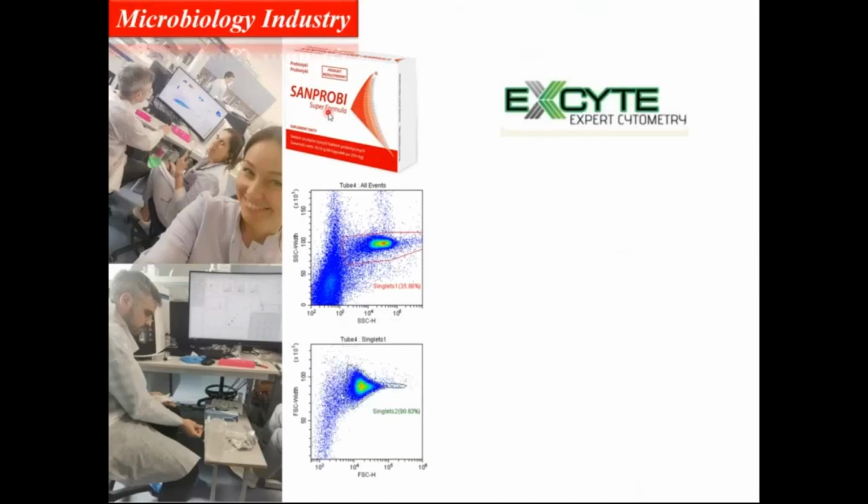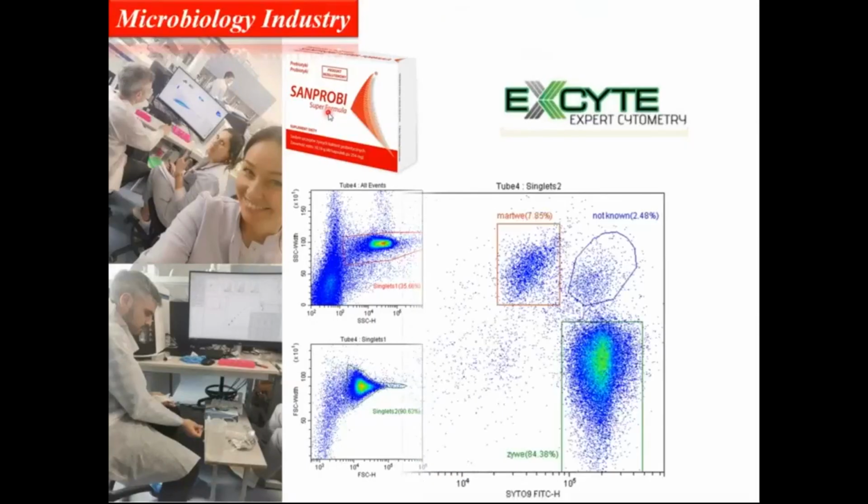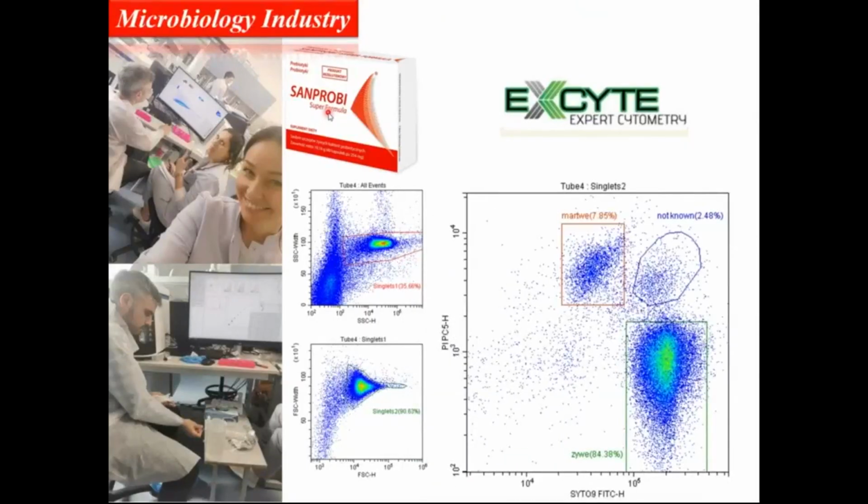And what we wanted to do is create clones. So we selected singlets. If we want to do cloning, we want just one bacterium. One of the things that we started to test first is this double population that we have here. These are dead cells, no problem. These are alive cells, fantastic. But this group here in microbiology is recognized as countable but not culturable. So you know that the bacteria are there, but when you put them in the same media as these ones, they do not grow.